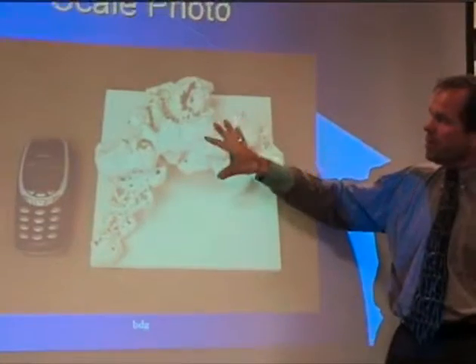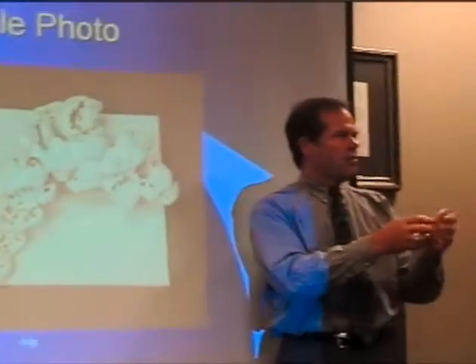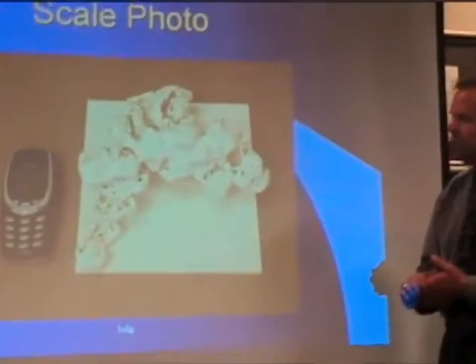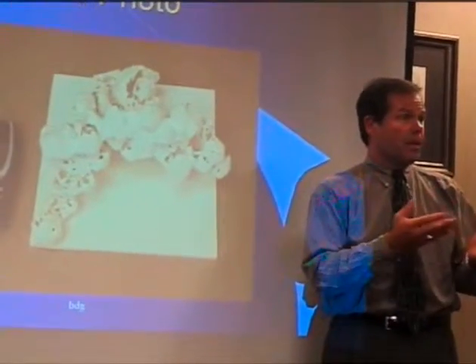This is hardened by putting in a polymer which infiltrates the solid, and then that solidifies, and then you can get in and touch it, and if you need to take dimensions or whatever you want to do, you can do that. So the sample is fairly fragile initially, but you can strengthen it, and the purpose is to build a 3D model that you can pick up and handle.